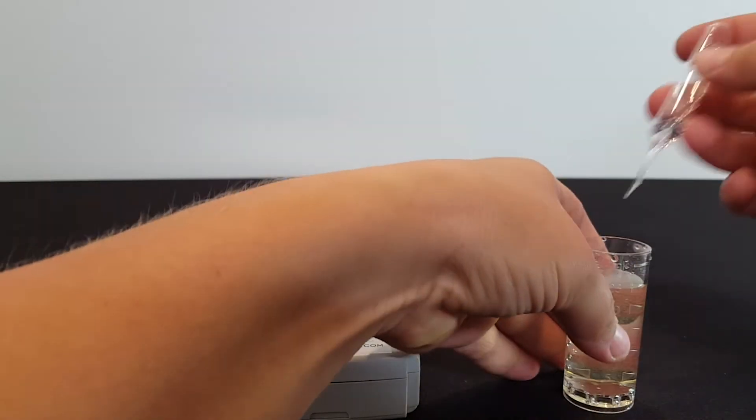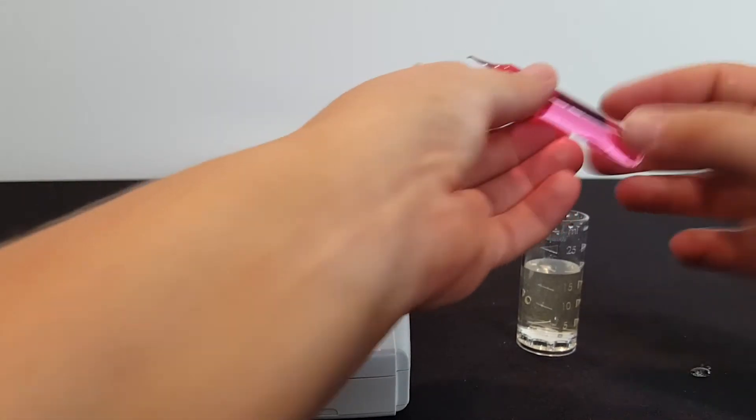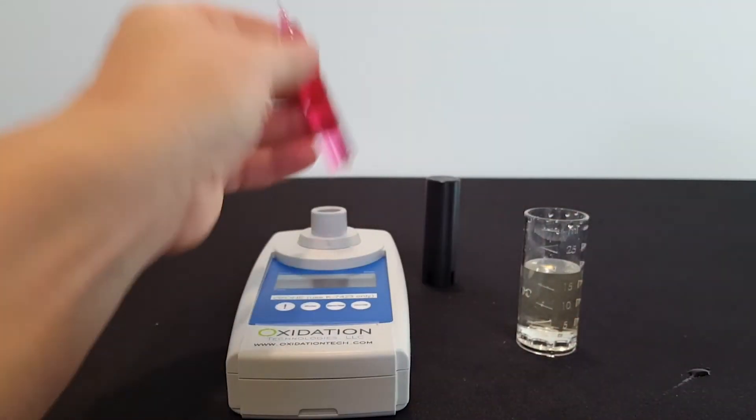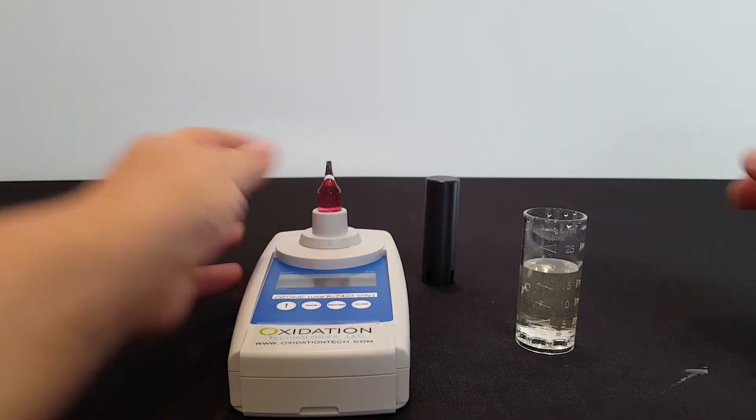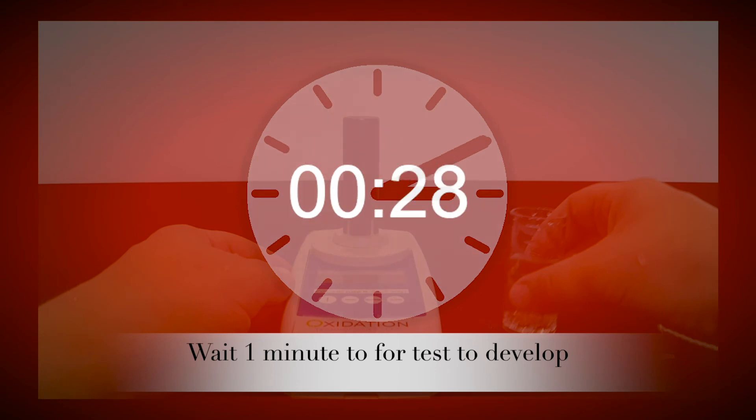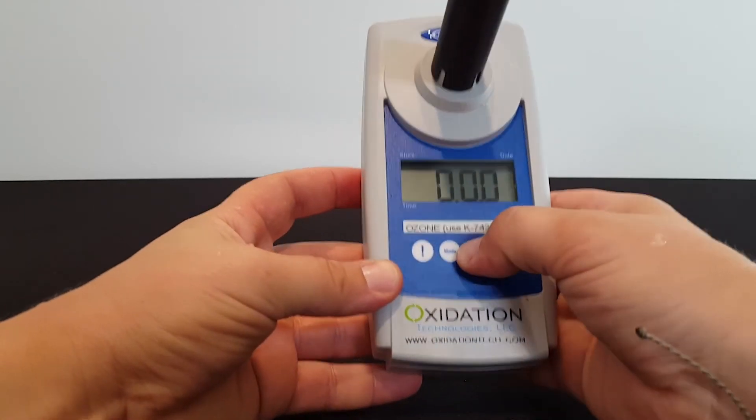I am then going to put the ampoule in, snap off the tip, it instantly fills with the sample, I am going to quickly dry it, and then I am going to press it into the meter, pushing it all the way down, put the light shield on, and then press the zero test button.